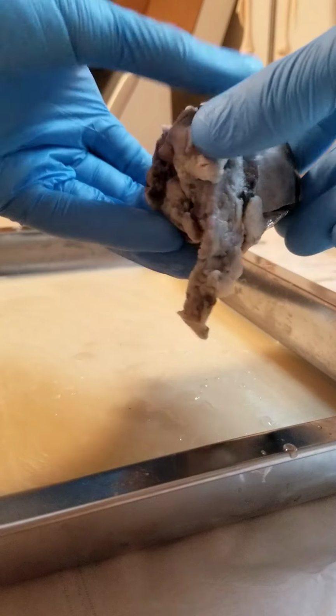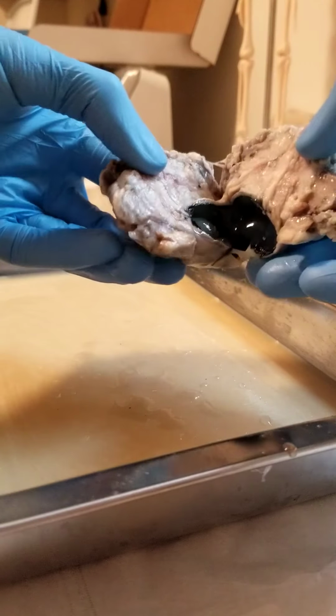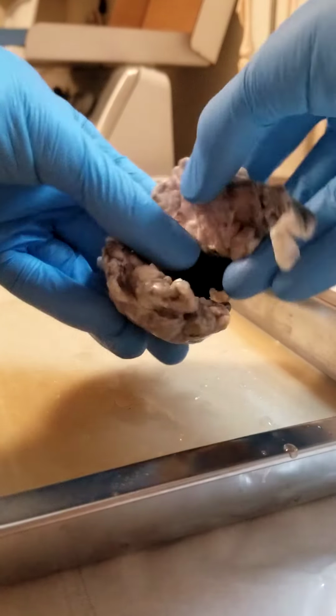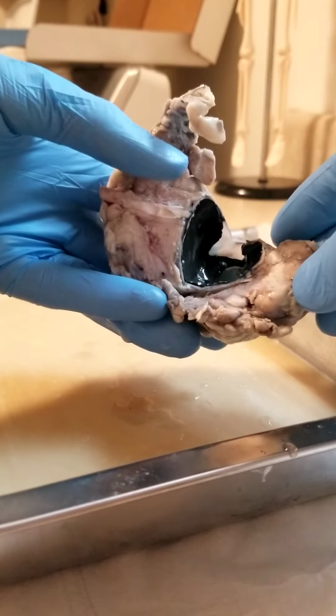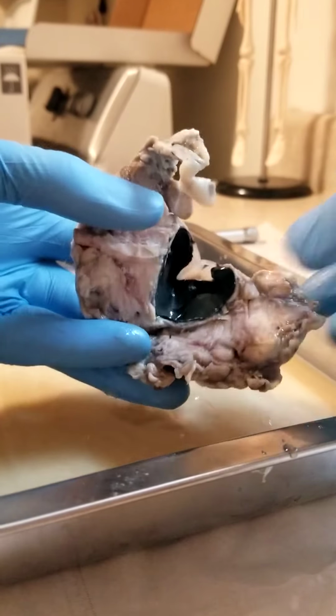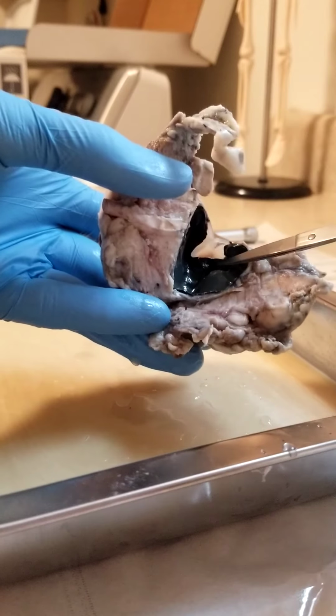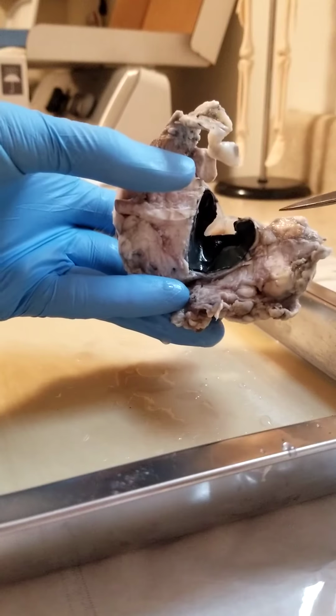When we go inside to the coronal section, your anterior chamber, this way is a little better. So this area right there. Your lens, you actually see it right there, floating white lens. You have your pupil. What else?